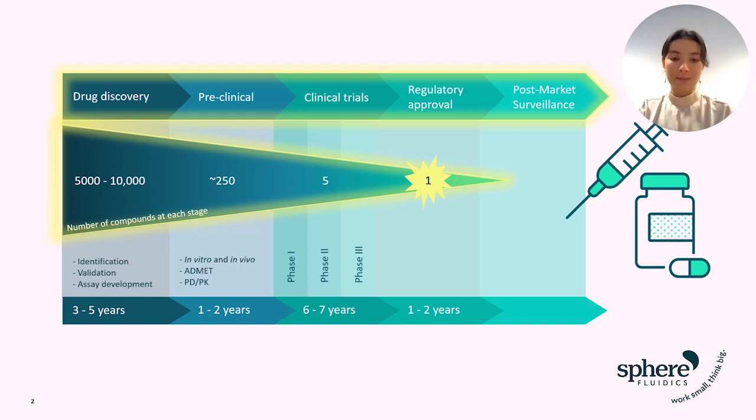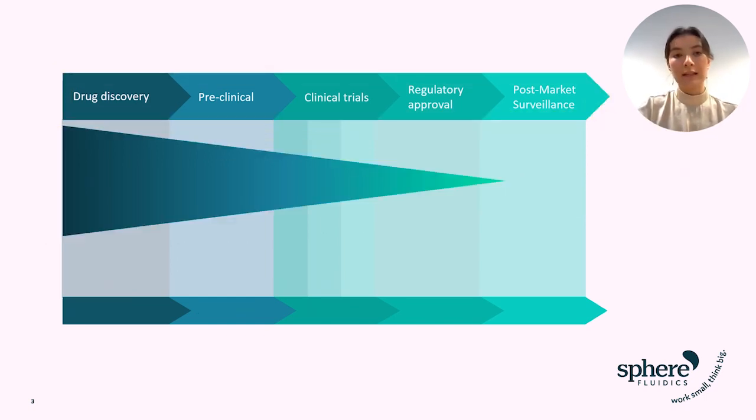And during these early discovery phases, as there are so many molecules to test, this is a significant investment of time and money for companies trying to push products through this process. Pharmaceutical companies want to quickly narrow down from thousands of potential molecules to just a few hundred. Therefore, this industry has seen a multitude of technological advancements in laboratory automation to combat the 2 major drawbacks of discovery: time and cost. And one area of drug development that has taken off recently is the world of biotherapeutics.